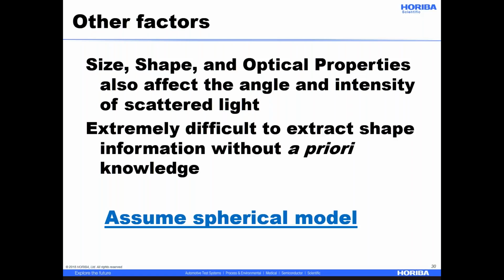And there are a few reasons that drive this. The first and strongest is most particle samples don't all have the same shape. And second, most instruments, including ours, do not do anything to align the particles.